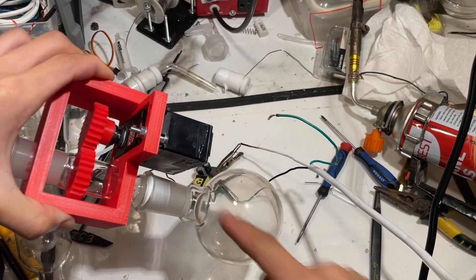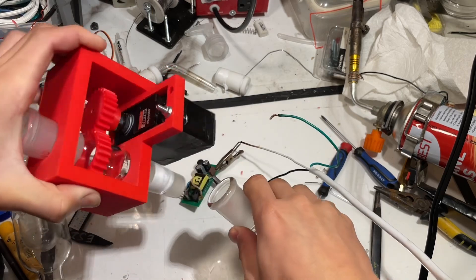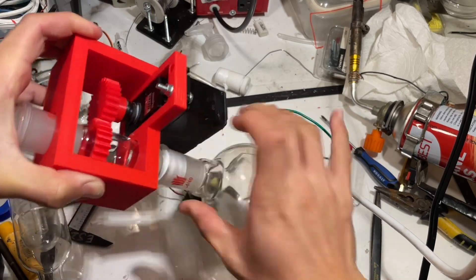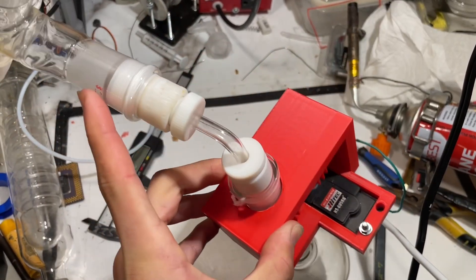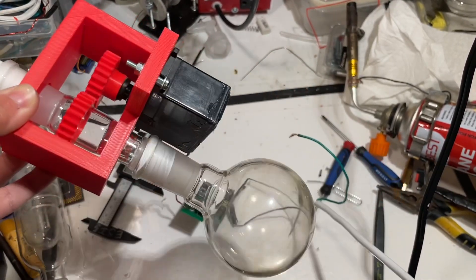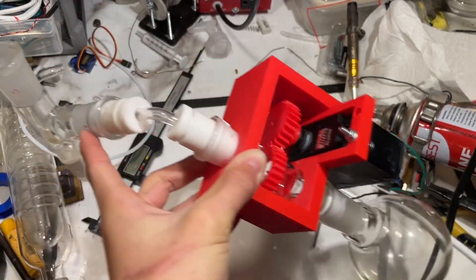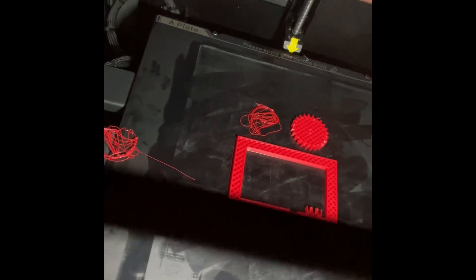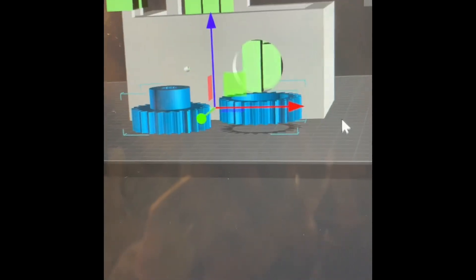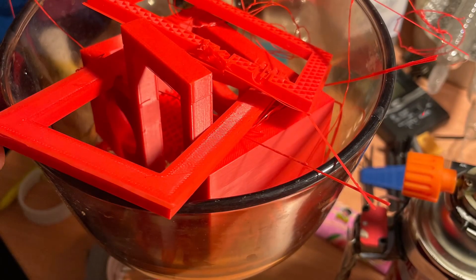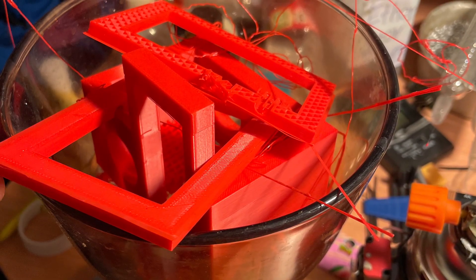I made another version, actually two more versions, and even then the final design is sort of trash, but I don't want to make more because it's using so much filament. I tried to print this thing twice and the gear always came out wrong. That's a lot of filament wasted.